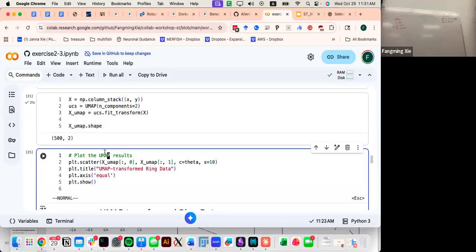Actually, I should call this some UMAP function, because initially you figure it out, then you become unconscious and later, yeah. It happens quite often. Usually the best practice is when you define it, you try to figure out what it is, and then don't mess up later. Yeah, sorry. Thank you.